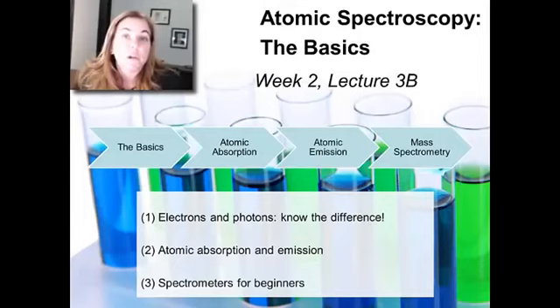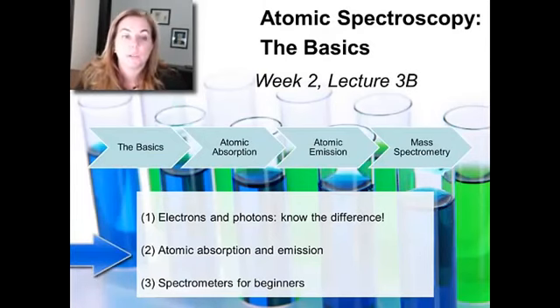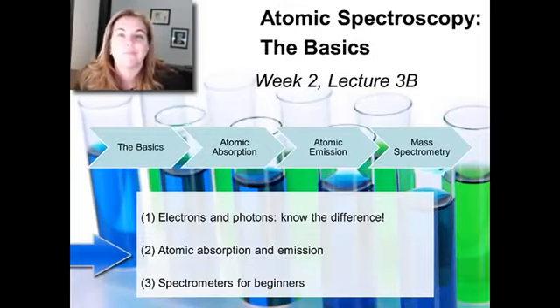Hi, so I'm continuing on with atomic spectroscopy in the second half of lecture 3 because it got a little long. Again, I'm speeding through this material relatively quickly. Hopefully it'll be familiar to most of you. And in this section, we're going to be specifically focusing on absorption and emission, as well as the very starting point for spectrometry. Okay, so let's start with light absorption.